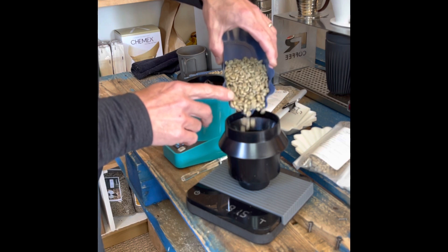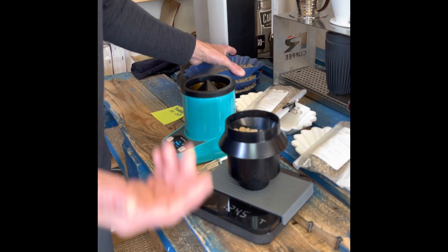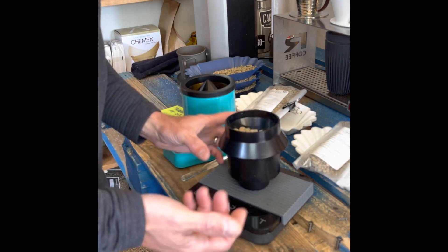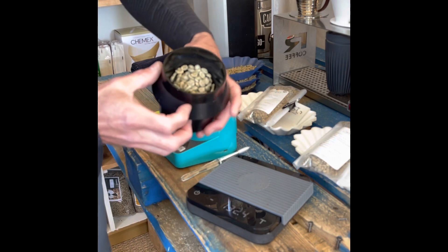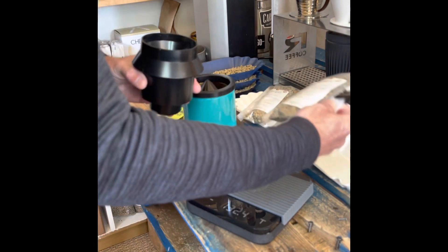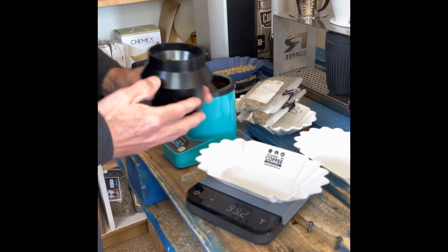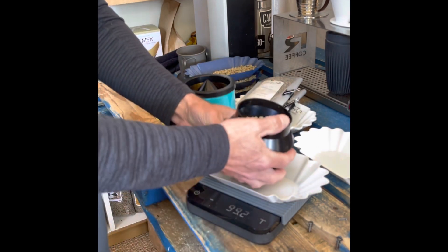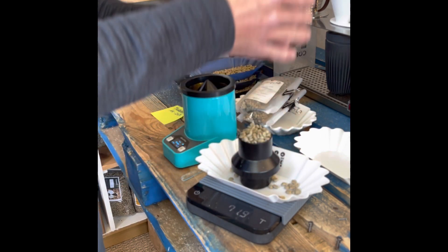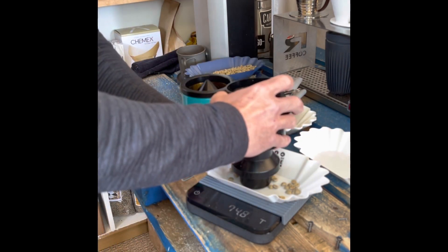This is the Kenya Tambaya AA. For those who are familiar, AA is a measurement of size in Kenya; other African coffees use AA, AB, B, C as size measurements. Here we have our coffee filled up to over the edge. The only thing not included in this machine is a way to contain the coffee when you lift the chamber — it does spill from the edges a bit. So I just need to level it off and get it nice and flat.